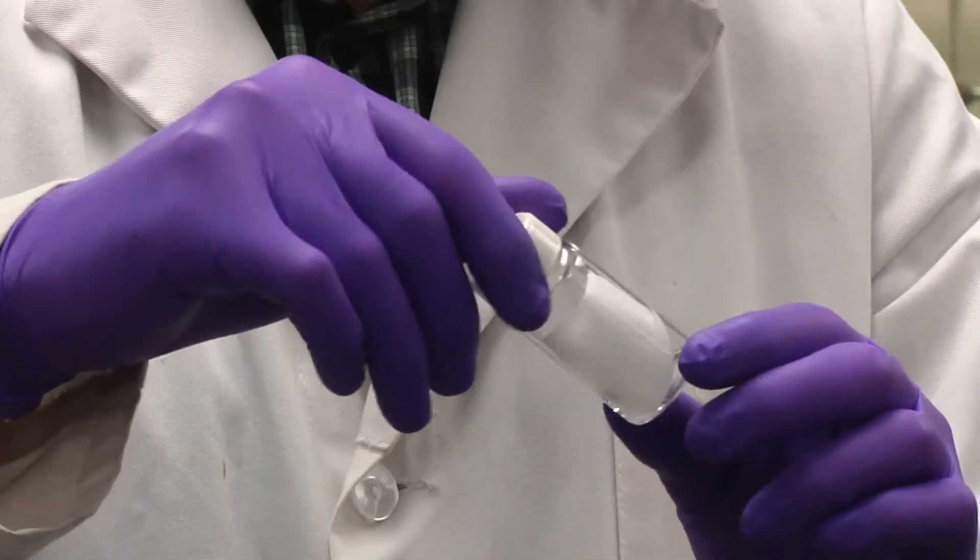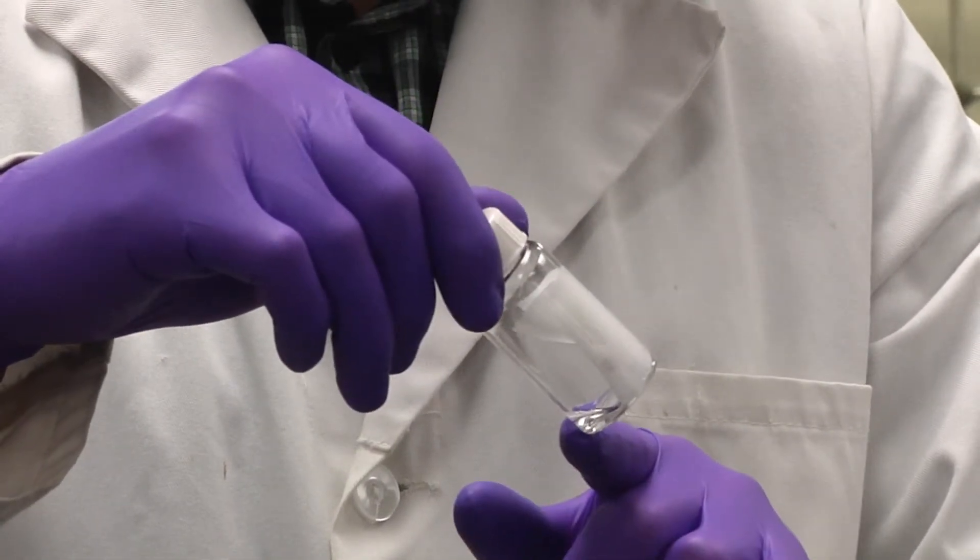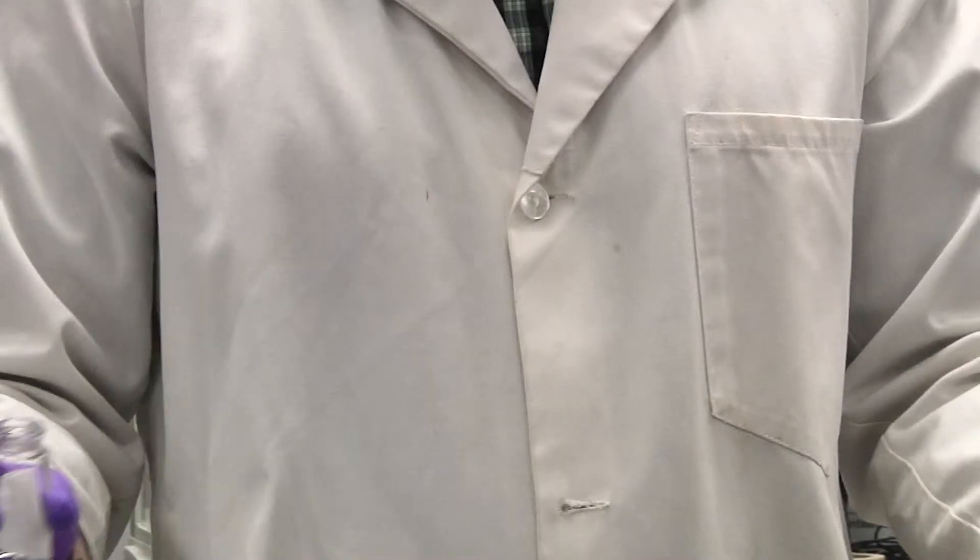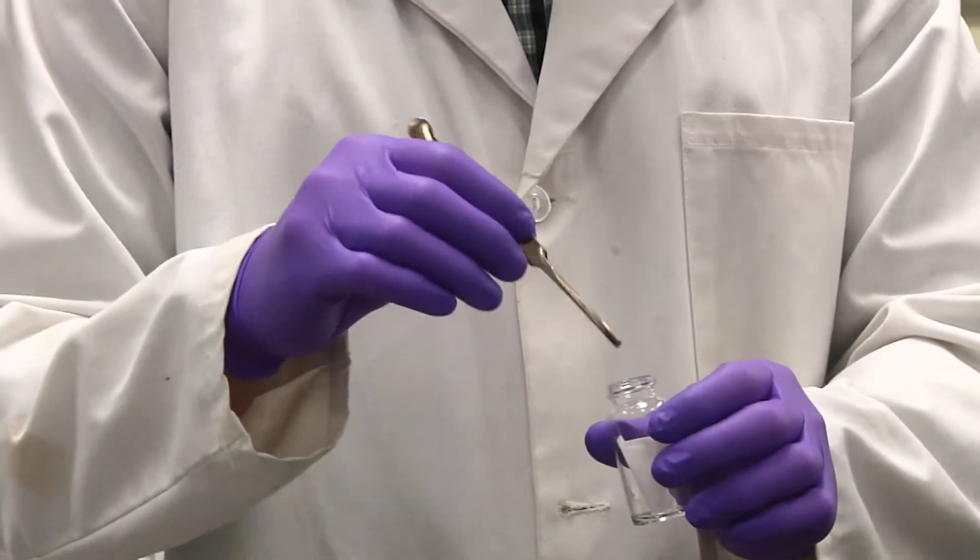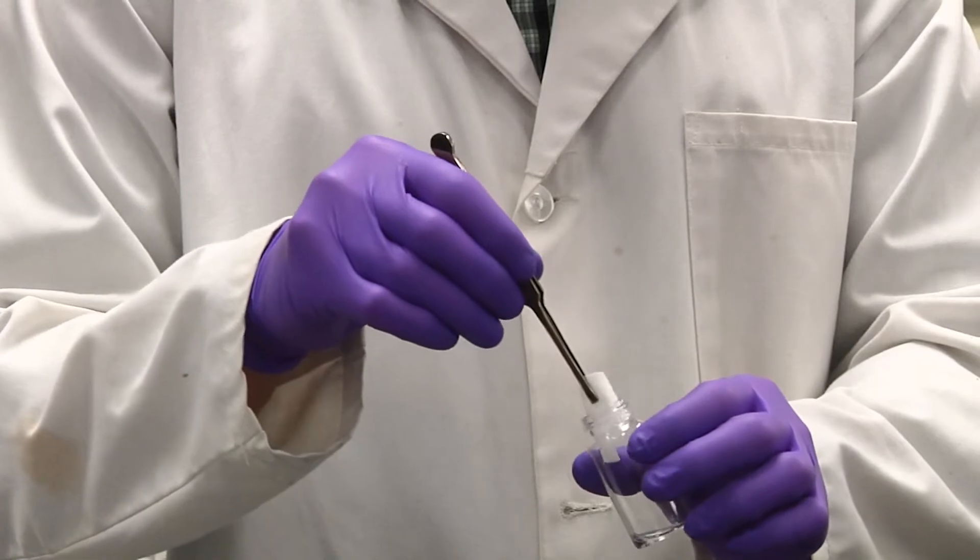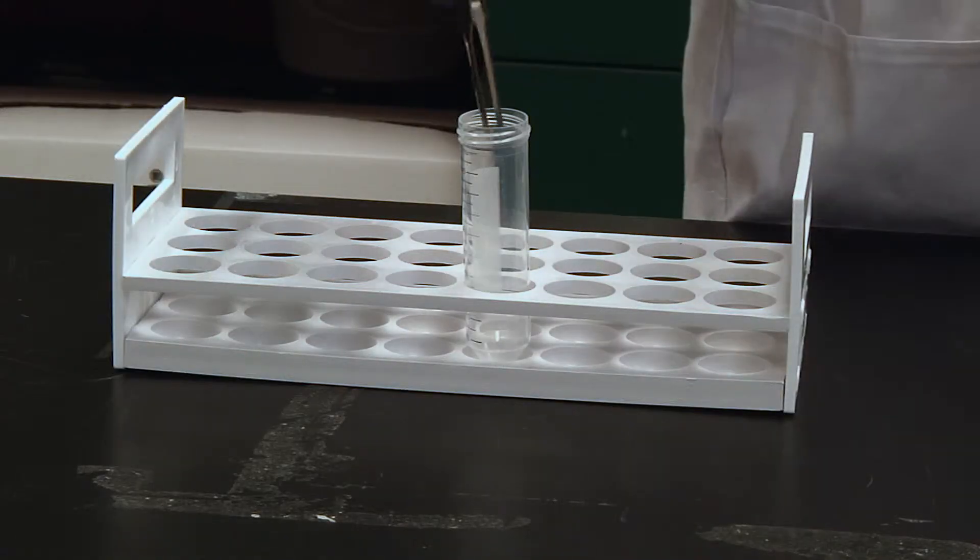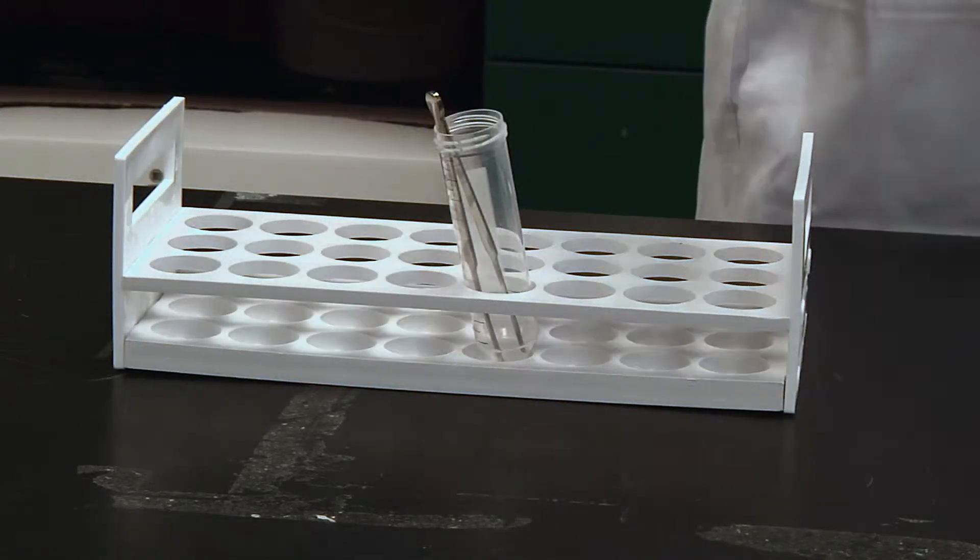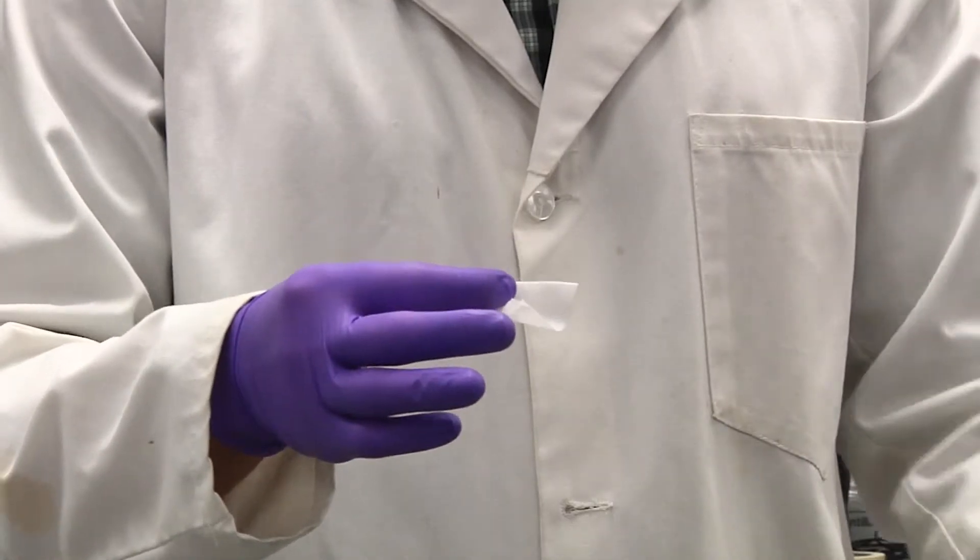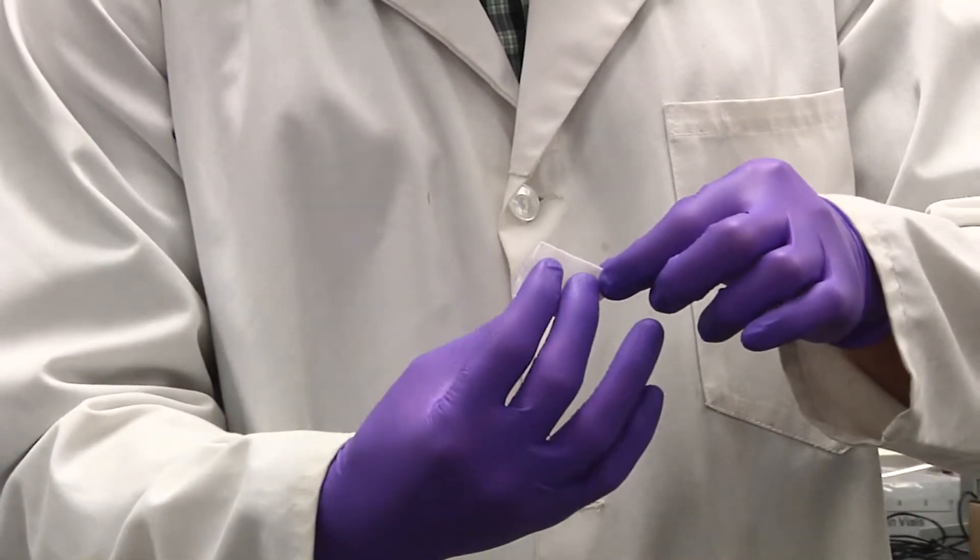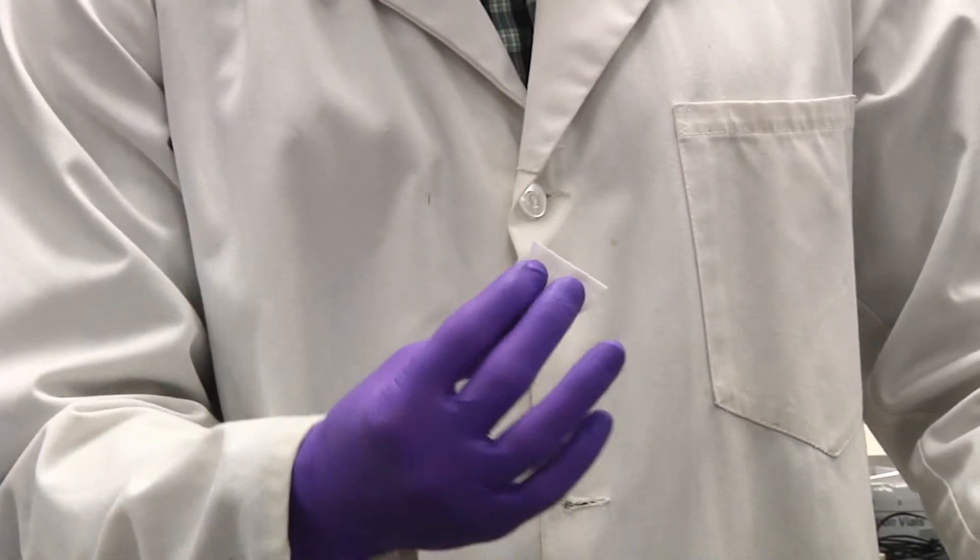Make sure the wipe is still moistened. There should be a small amount of solvent visible in the vial. Using clean tweezers, partially remove the wipe from the vial. Place the tweezers in the clean holder. Carefully remove the wipe and set down the vial. Grasp the wipe between your thumb and your index and middle fingers.